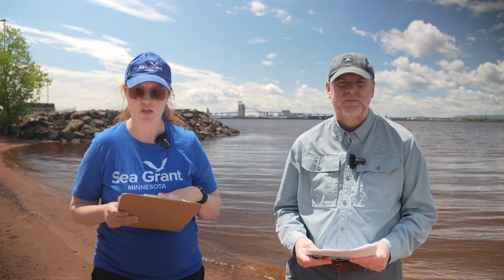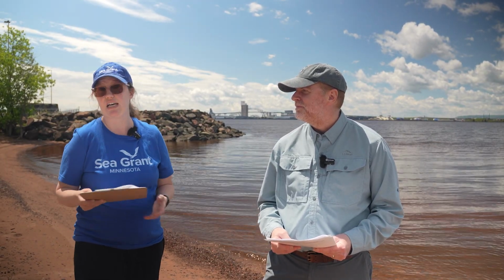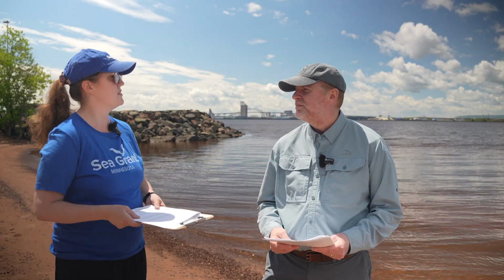Okay, so by the end of this video, you will know how to safely collect a surface water sample. You'll be able to identify if it is an algal bloom, a cyanobacteria bloom. You'll be able to collect environmental data using bloom images. You'll have a pocket microscope in your sampling kit to do this, and you'll be able to enter the data into a database. That'll be kind of our next step, is how to actually deal with the data once you've collected it. But first we're going to talk about some safety guidelines for when you're out in the field.